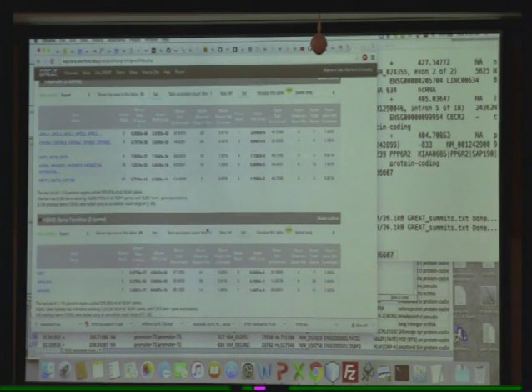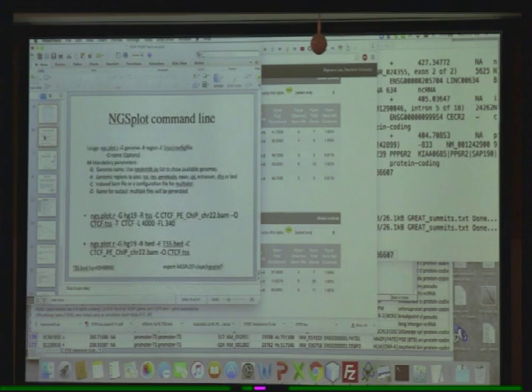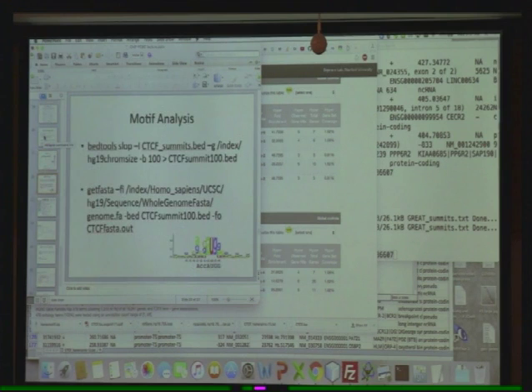Are there any programs that allow you to map motifs to identify the strengths? Yeah. So that's right next. If we have time, do we have time? 3 minutes. Okay. So since we only have 3 minutes, I'm not going to talk about making more publication figures for it. Let's go straight into motif analysis.